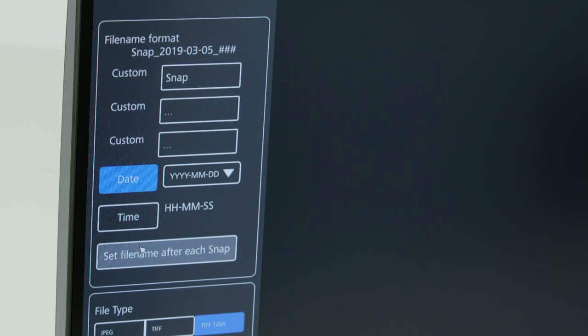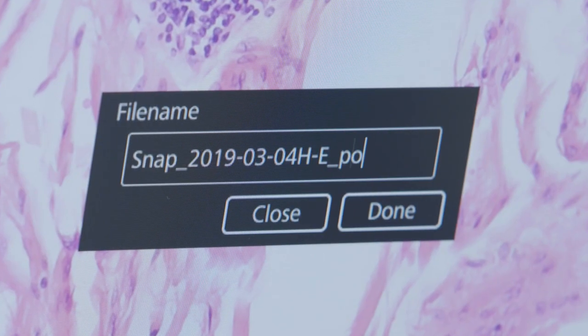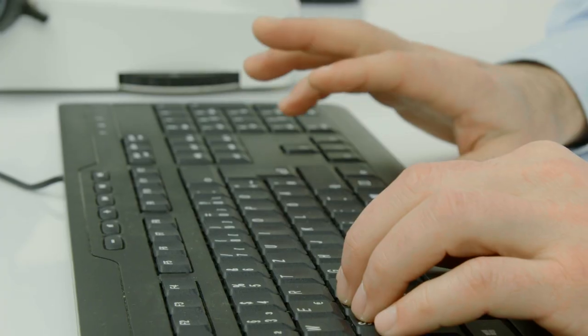If you wish, you can define a name for your file via the on-screen display. And there you have it.